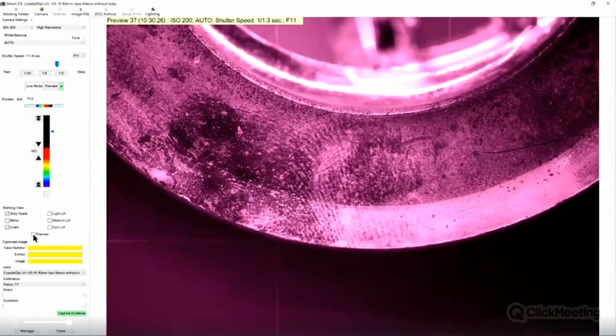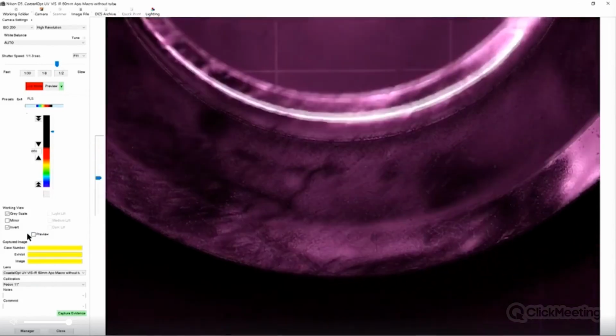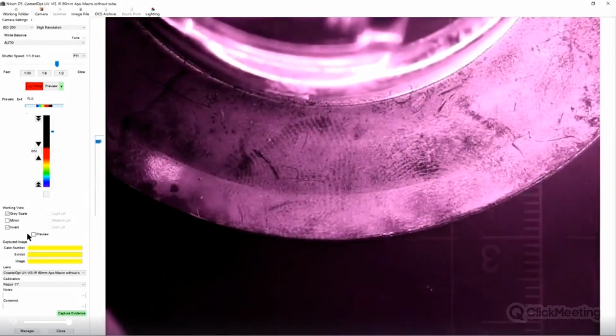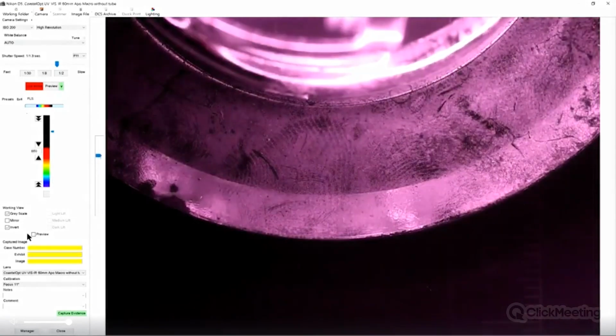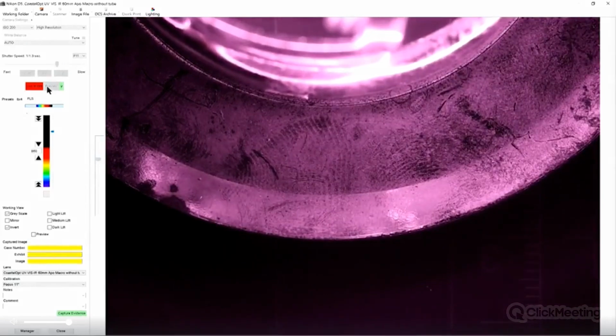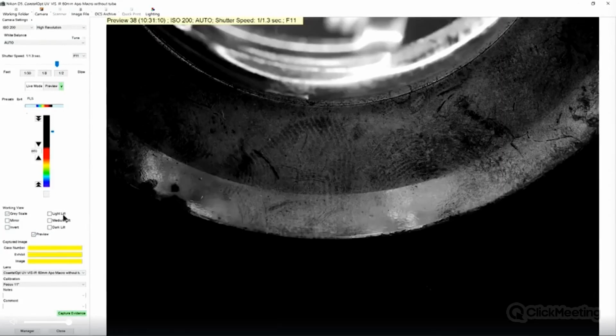We then also go back into live mode and we rotate our fitting around to search for other finger marks. We can now very clearly see on the other side we have multiple fingerprints becoming visible. Take a preview. And then finally grayscale and invert, and here we have a finger mark here and a finger mark here, and a finger mark here.